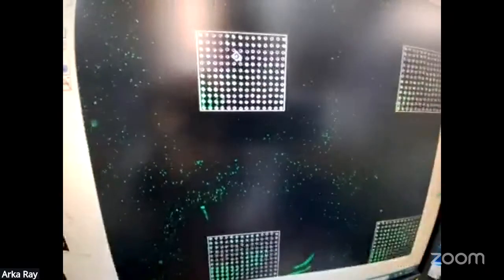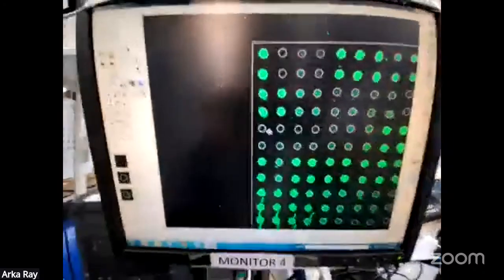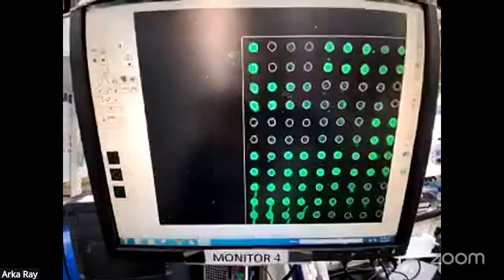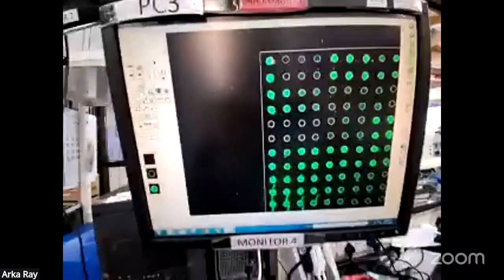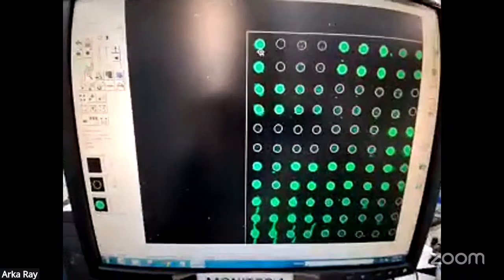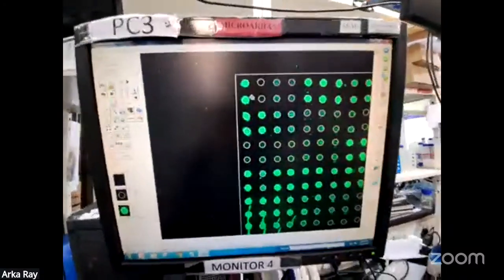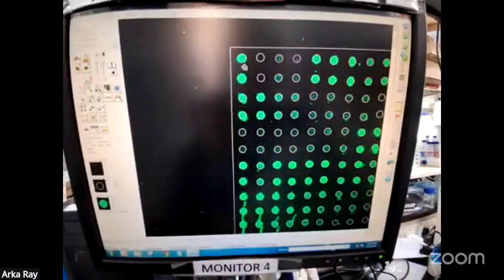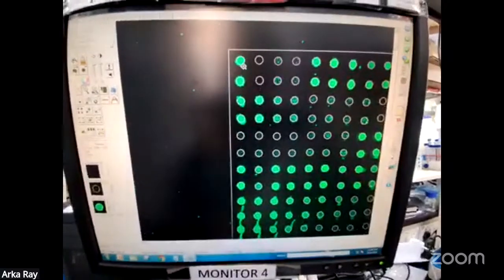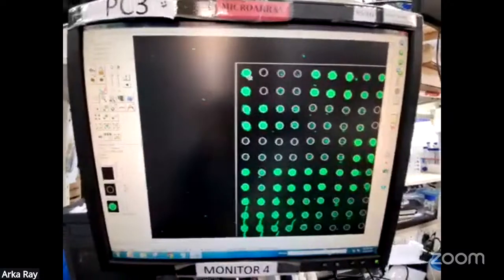So this is the gal file. The gal file is called the GenePix Array List. It is the annotation of the proteins or peptides, and this grid is obtained automatically. But we have also recently developed our own indigenous gal code with which we can generate the gal file. This is the gal file. You can see the circular grid, which helps you to segregate the foreground and background.